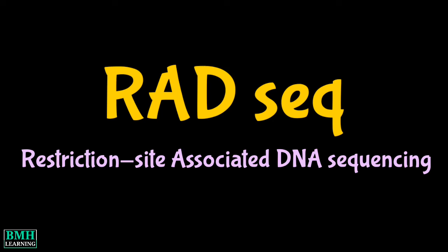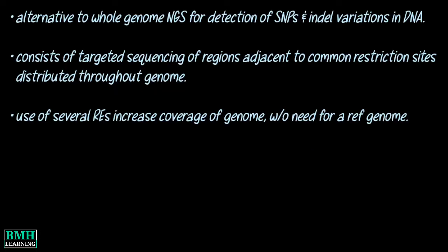In this video, we will talk about RAD-seq, also called Restriction Site Associated DNA Sequencing. RAD-seq represents an alternative to whole genome NGS sequencing for the detection of SNPs and indel variations in DNA.